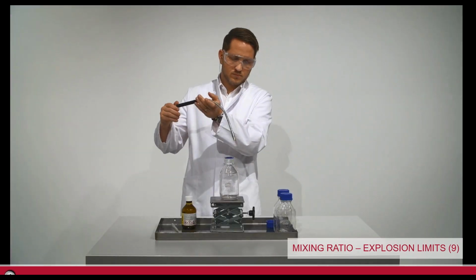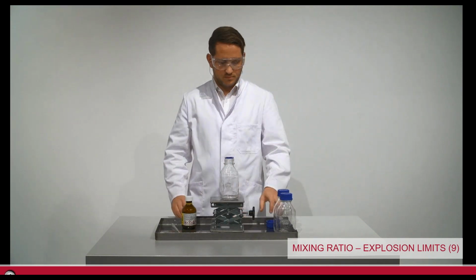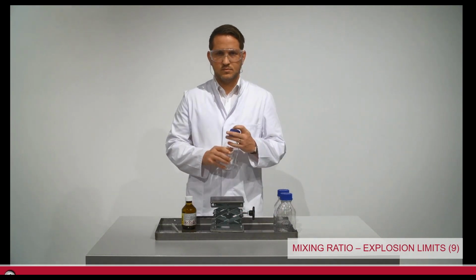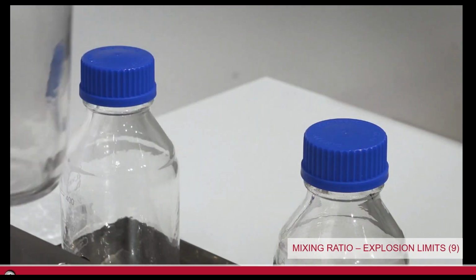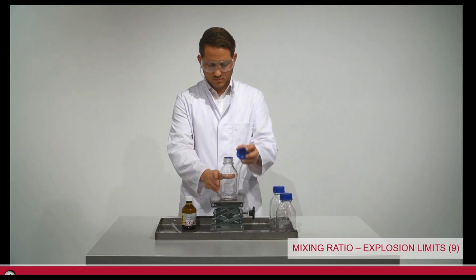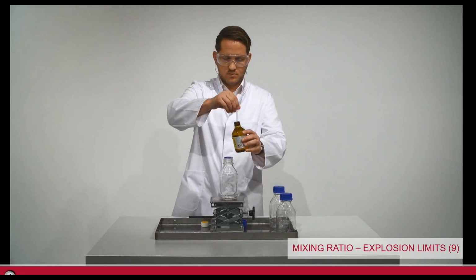All right, so nothing catastrophic. 1 drop, 250 mils. Obviously, that's not enough. I mean, I was pulling your leg a little bit, right? Nothing's going to happen with 1 drop and 250 mils, or 500 mils. Sorry, I keep saying that incorrectly. It's 500 mils. Now he's going to put 4 or 5 drops in.